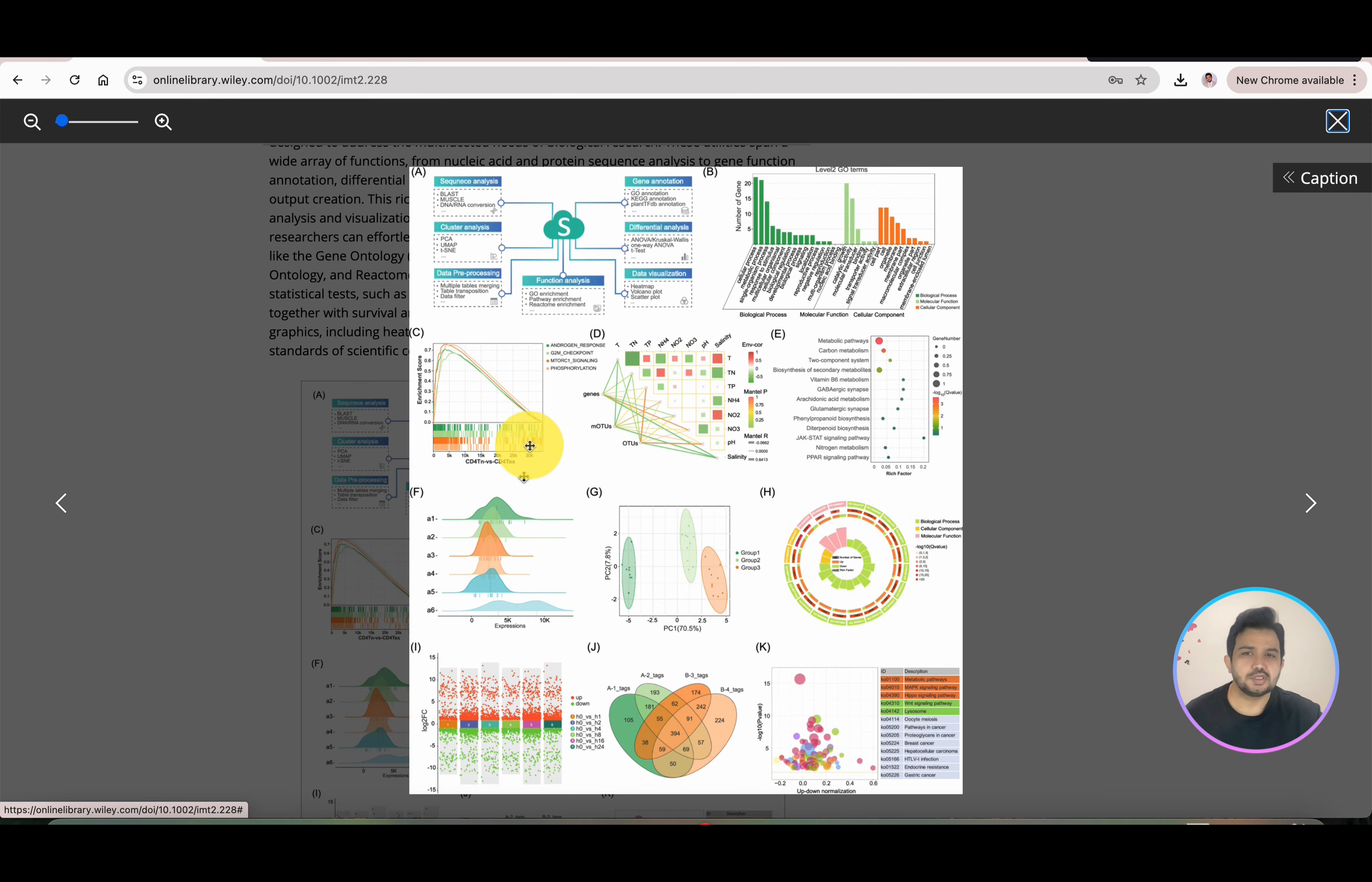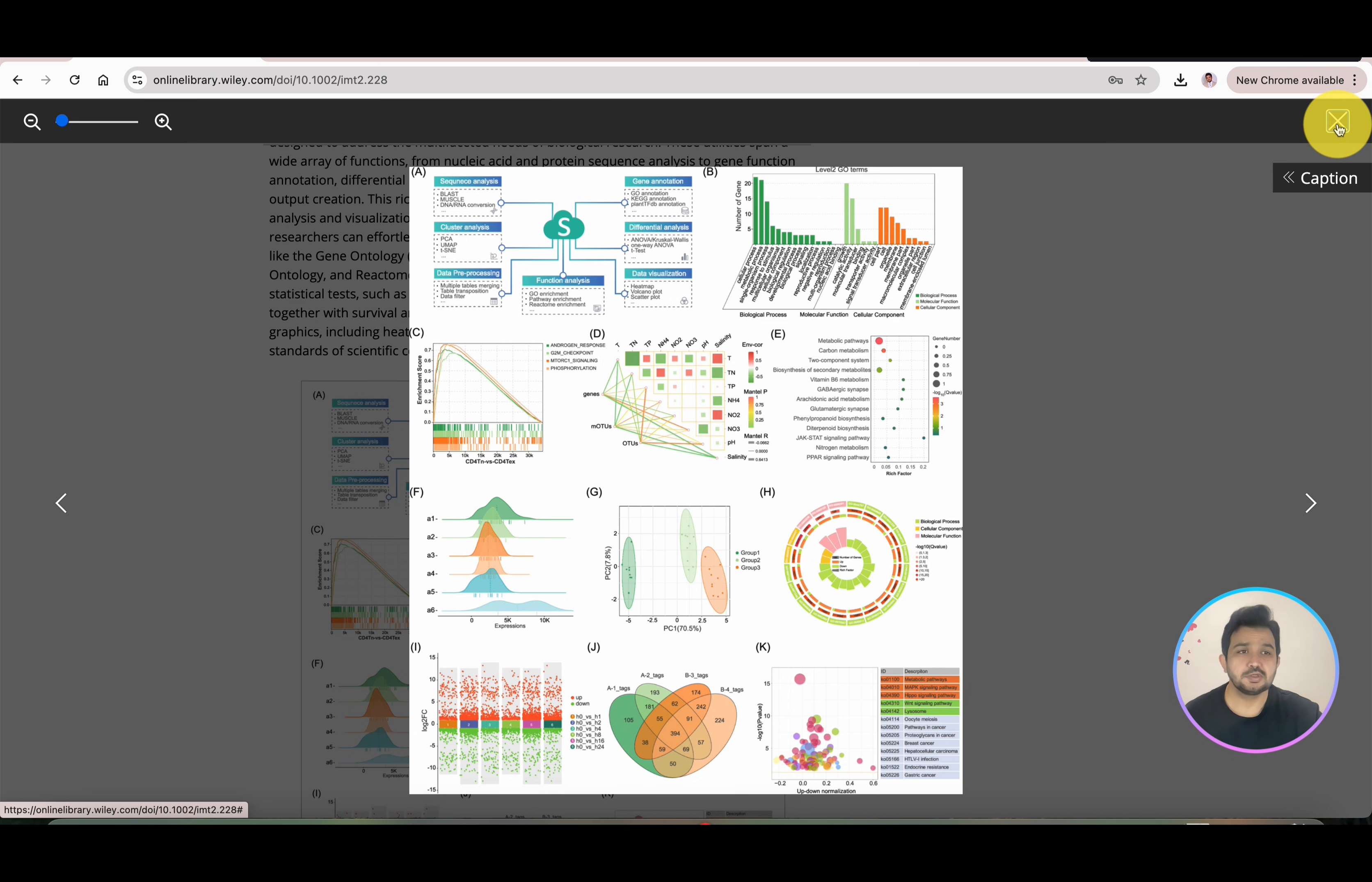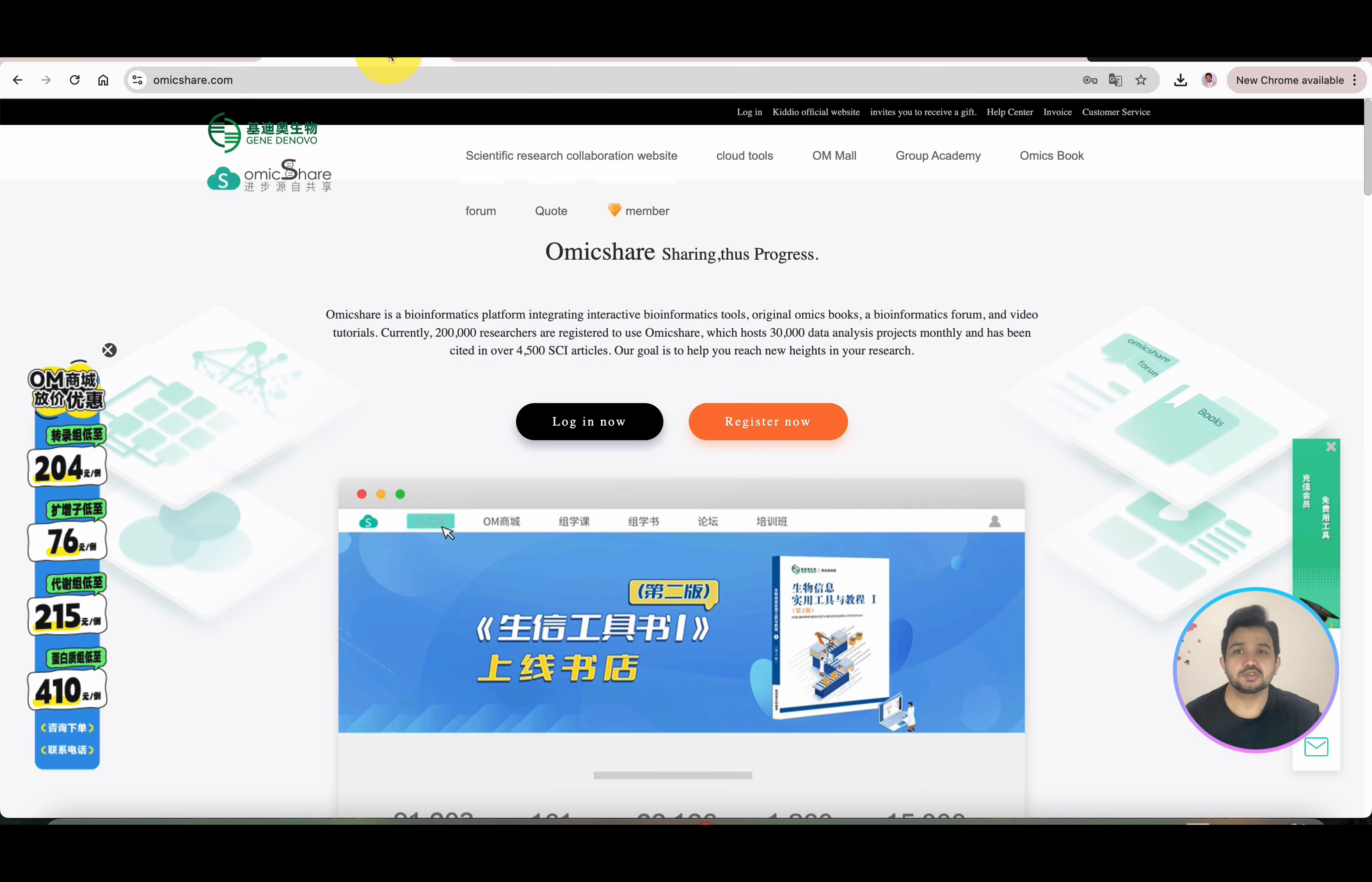As you can see, you can draw different flow charts, gene ontology, Mantel test, KEGG pathways, gene ontology in circular form, Venn diagrams, heat maps, and many other visualizations. Without further ado, let me go to this website and show you how you can register and use its different tools.